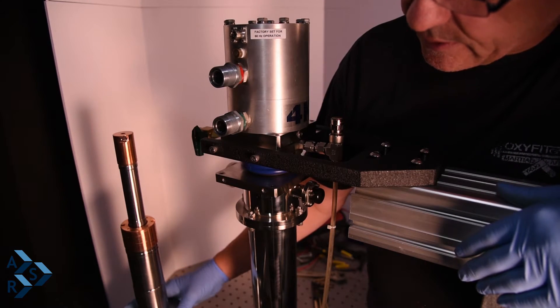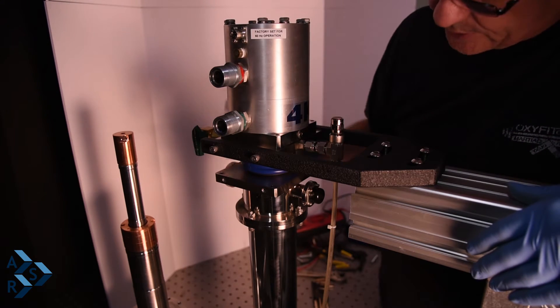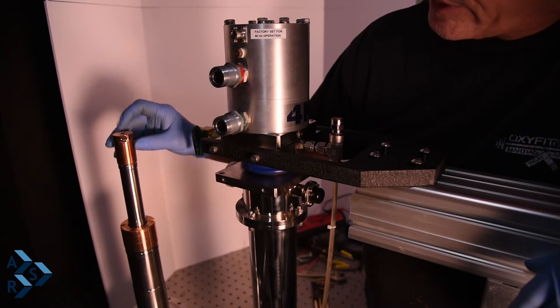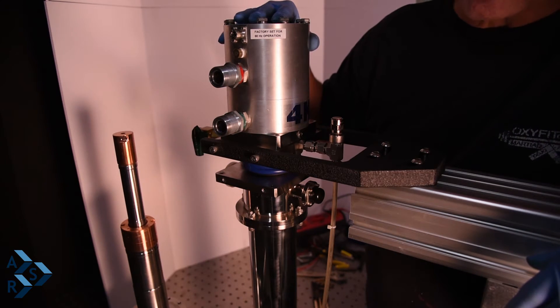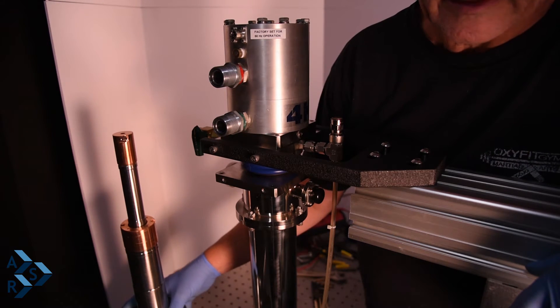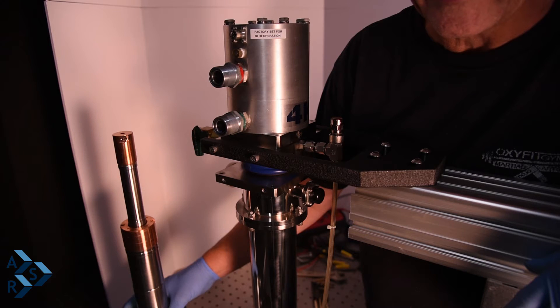This is the cryostat that is mounted from the square flange or round flange going inside the interface — two separate components. This is your second stage, your first stage, and a radiator mounted to the top that creates your convection loop. Normally if there's a problem with your cryostat, you don't have to send the whole thing back unless you have a vacuum leak. A lot of times after 8,000 to 10,000 hours it's time for a seal replacement and maintenance.